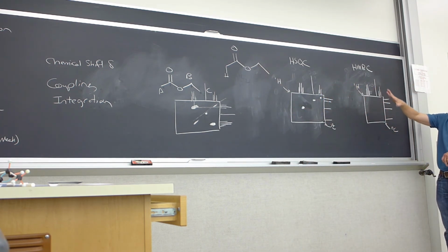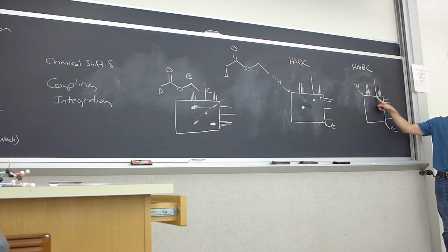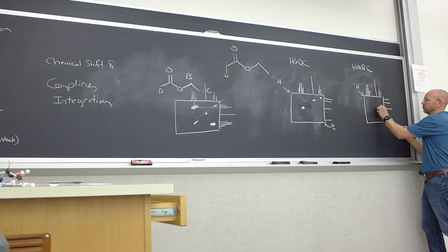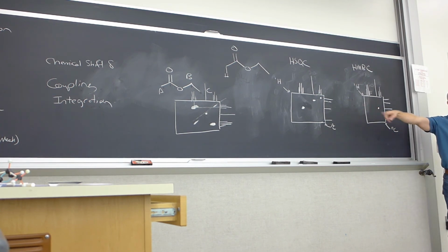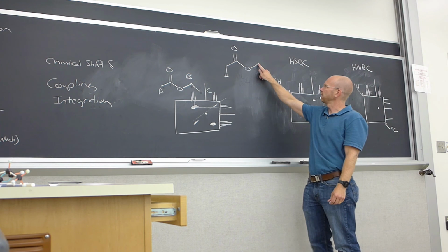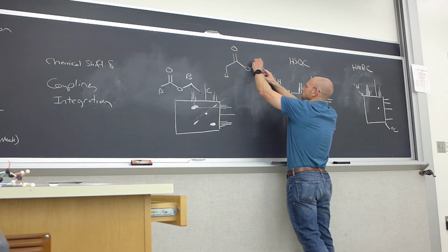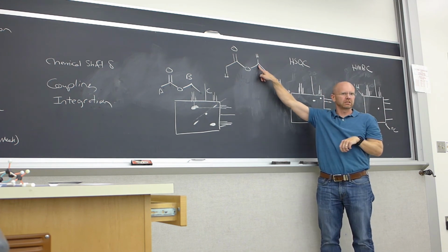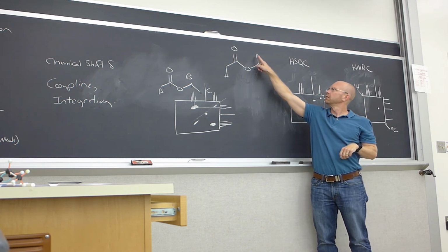So that proton is this group, right? And that carbon is this group. So it's a different pattern than the HSQC because now it's 3 or 4 bonds away. Everyone comfortable with this? So we could predict all of the peaks we expect by looking 3 or 4 bonds away. So how about these protons? Which carbon or carbons would you expect to see an HMBC peak for that proton?